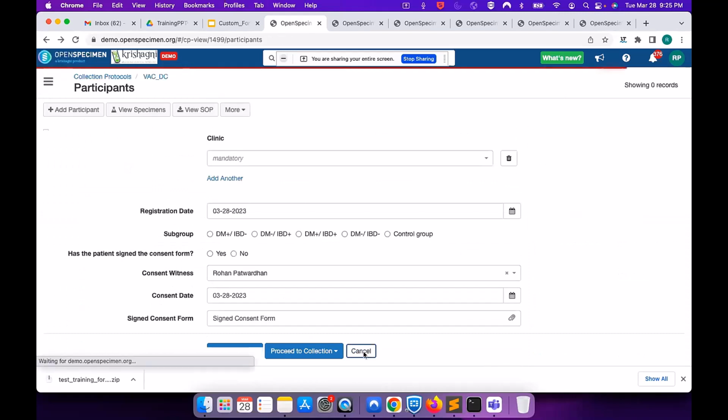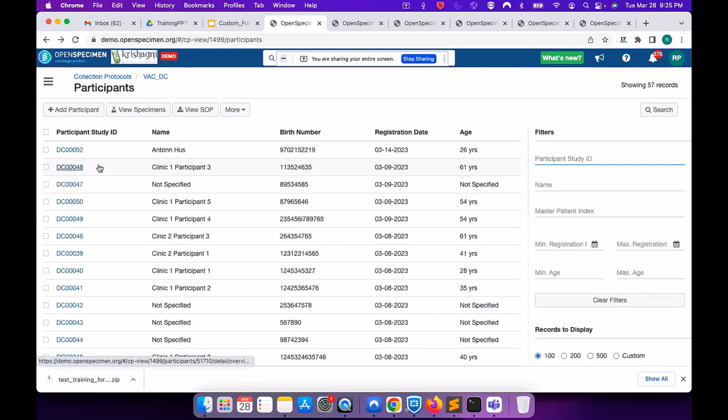I will just use an existing participant to save some time.